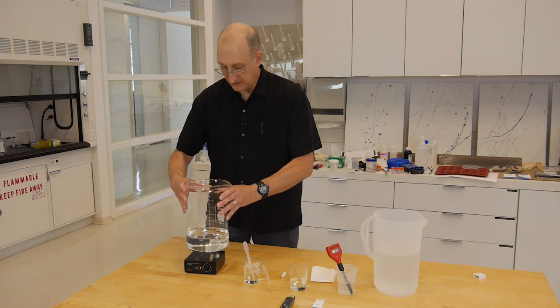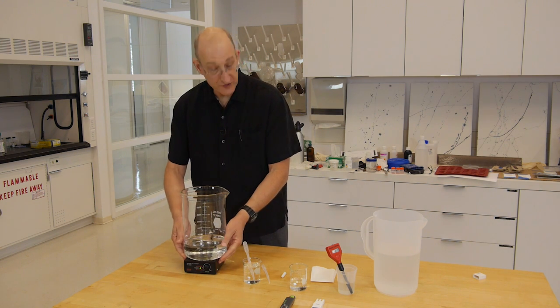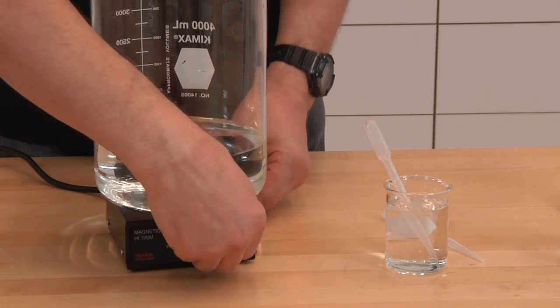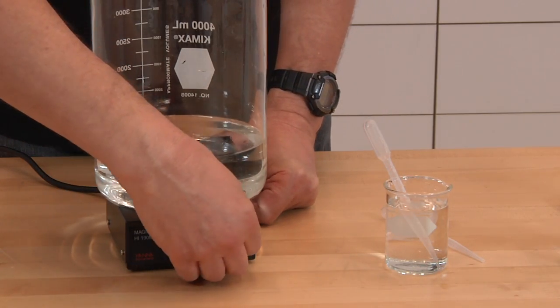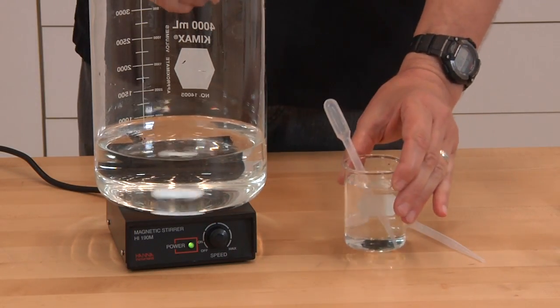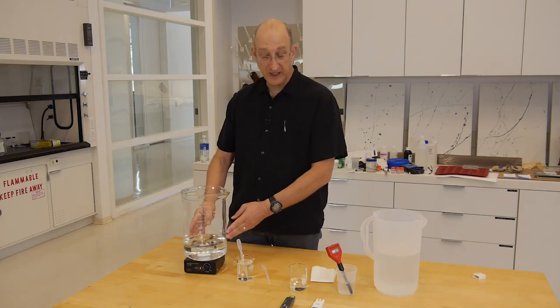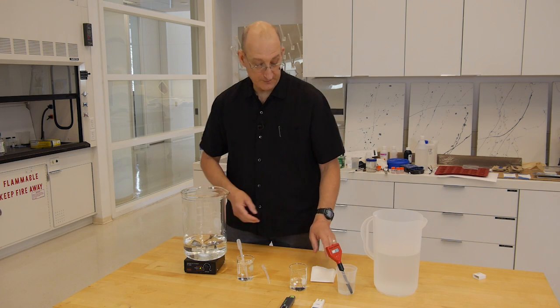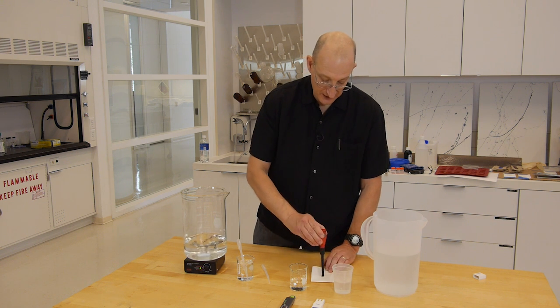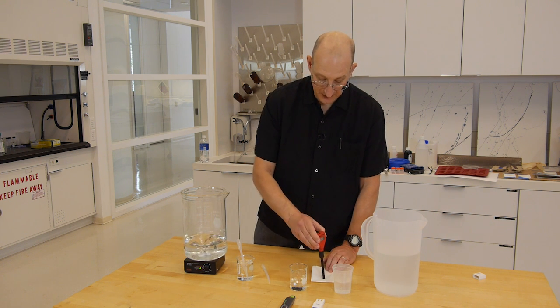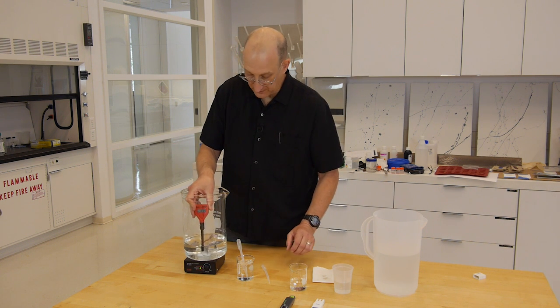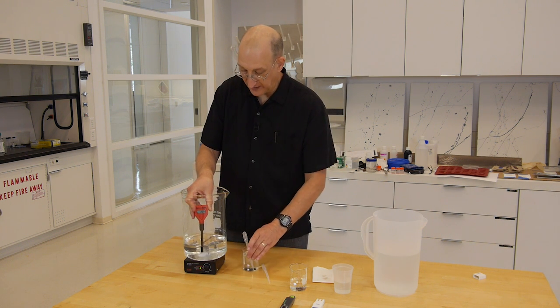So here's our 10 milliliters of glacial acetic acid in a liter of water. Put in our stir bar, start it stirring. Now we're going to add the 10% ammonium hydroxide to this until we get the pH of 6.0. We have the pH meter in tap water, blot, distilled water, blot, and into our acetic acid solution.